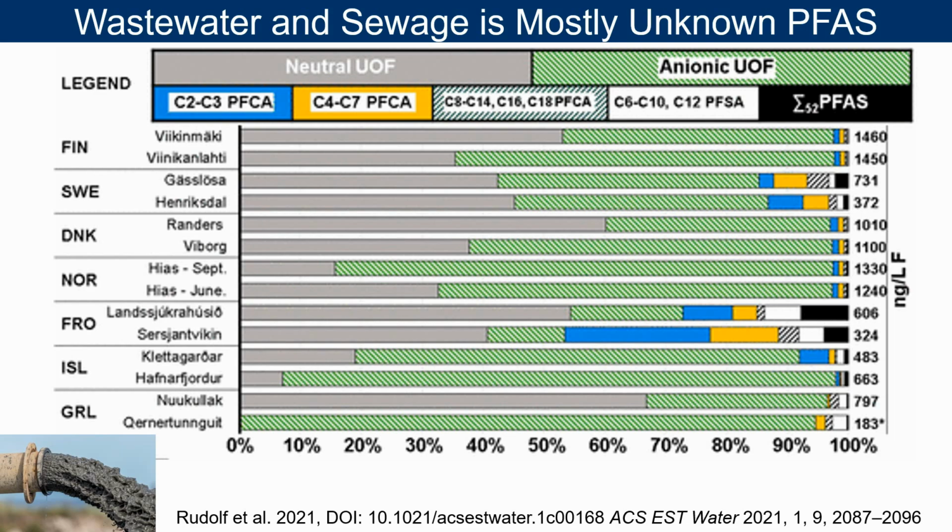In targeted, you're looking for a narrower range of PFAS, only those that you know exist and that you can synthesize and have known chemicals for, and non-targeted, you can use universal principles for and discover a much wider net of PFAS.